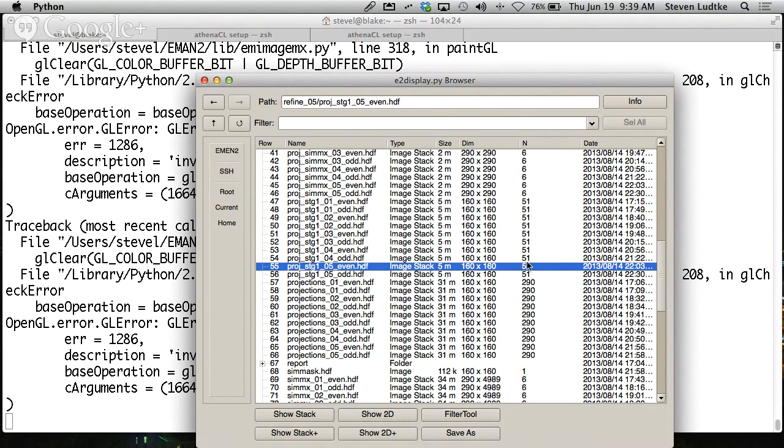So if we have 300, it goes down to a number something like 50. If we have 5,000, it will still get down to a number something like 100 or 200. So this is an algorithm which gives you more benefit the larger the problem is. If you're doing a really small refinement, like GroEL on your laptop, you may go from 100 projections down to 30 projections. It's going to save you a factor of 2 or 3 maybe, but not a really large factor. If you're doing something like a ribosome at 3 angstrom resolution, however, and you've got 5,000 projections, it's going to save you maybe a factor of 20 or 30 in time. So you gain more and more benefit the bigger your project becomes.